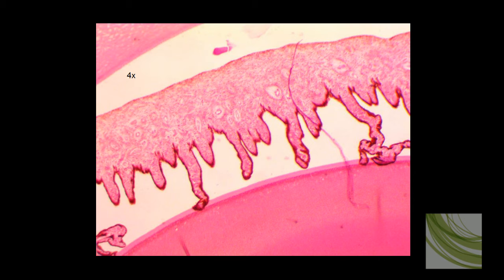Now we're going to look at the ciliary body and the lens. Now in this slide, using the 4x objective, we can see several things. Here's the lens. These are ciliary processes. And there's the ciliary body. This would be the cornea.